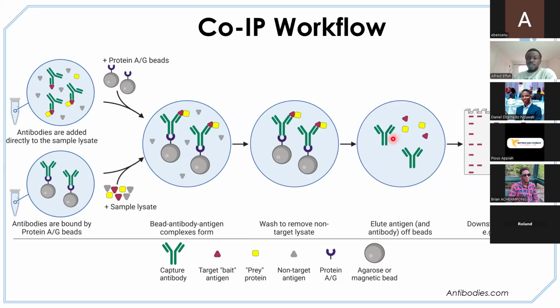So now we use antibodies against A. And we suspect that if A was interacting with protein X, we should see protein X here. Assuming there was no interaction, then we shouldn't see these yellow things here. And so we are going to use antibodies against X. So over here, not A again, but rather against X. Now, when we are able to see protein X here, then we can say that, yes, there was an interaction between protein A and then X.